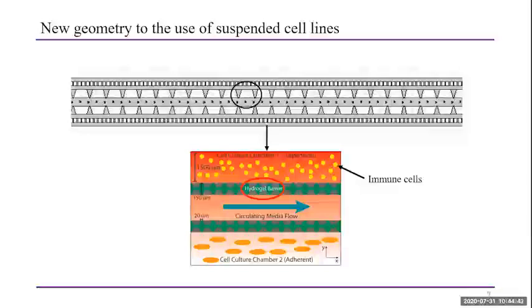Thanks, Mallory. All right, Dr. Flake. Yeah, so I had a question on the co-culturing of two types of cells. Why are you doing this? Why do you need 2 different types?